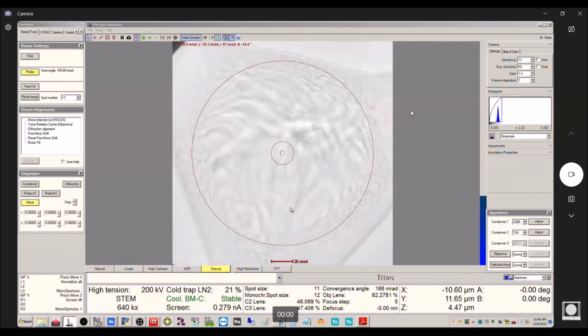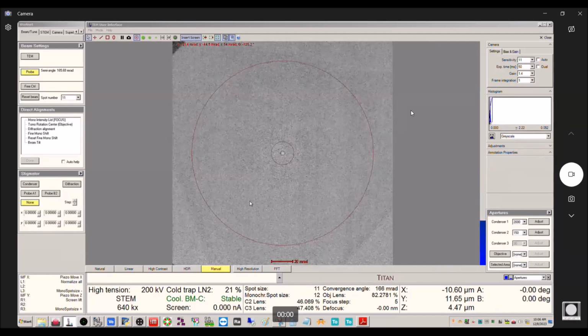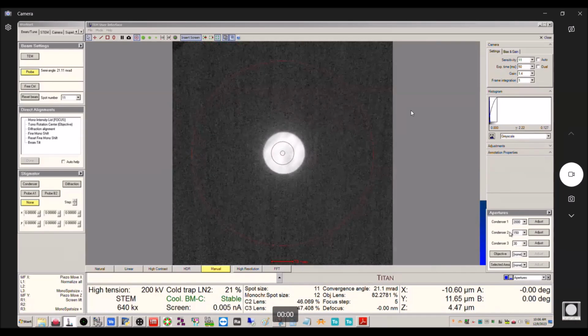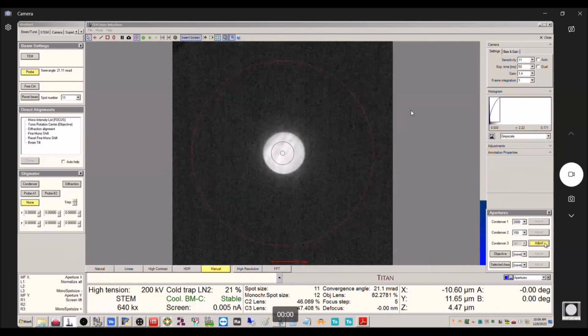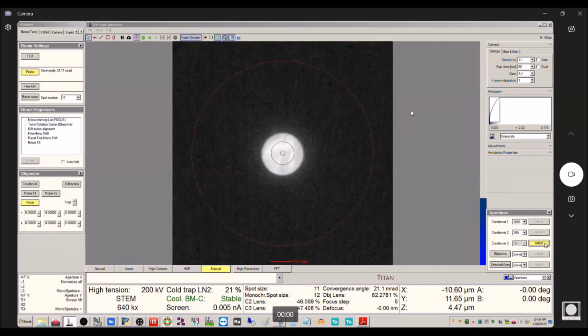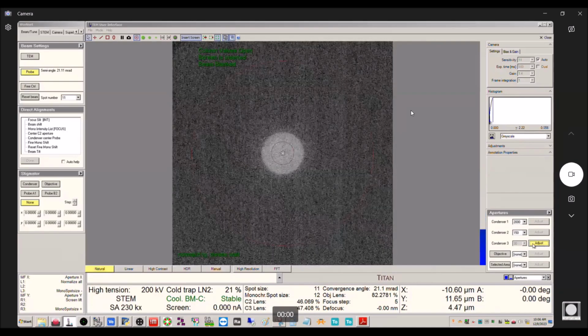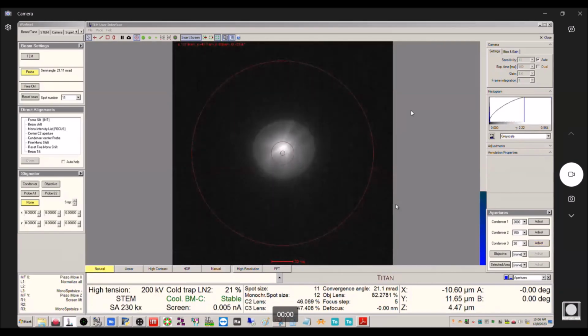All right, let's put this back to the 30. Okay, turn this off. Okay, so it looks like we're still pretty good.